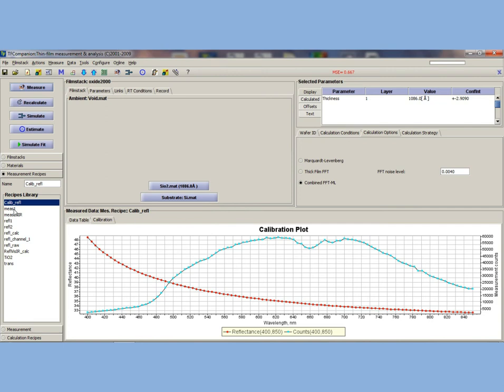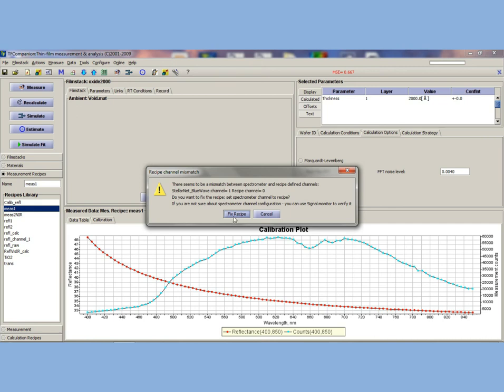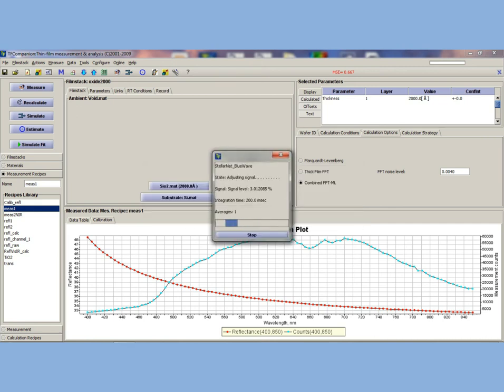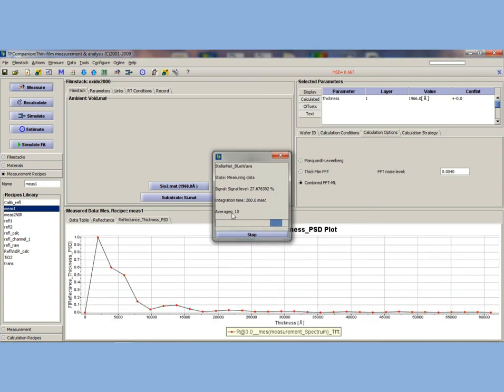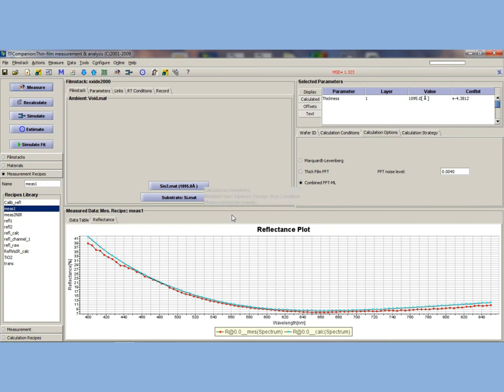Now we see the calibration plot. Next, go to the measurement recipes and click measure one. This recipe details our standards for silicon dioxide over silicon. The red line represents the spectral reflectance curve measured by your StellarNet hardware, and the blue line represents the fit.